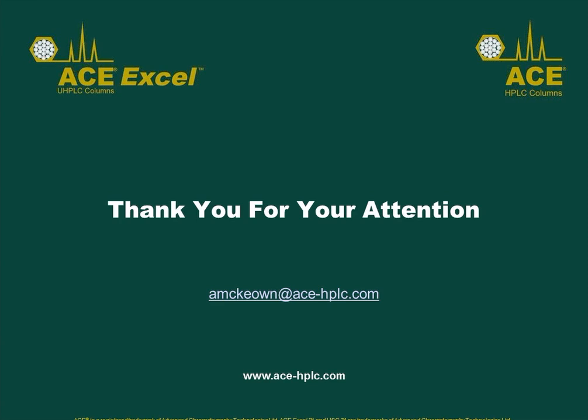First up is: if I switch from a conventional C18 column to one of the ACE columns, what would you recommend doing for method development? Would you recommend starting with the same mobile phase to develop the method and taking it from there, or going back and developing a method from scratch?